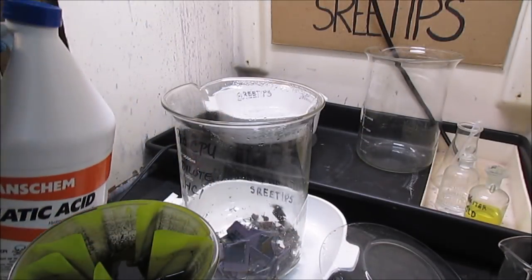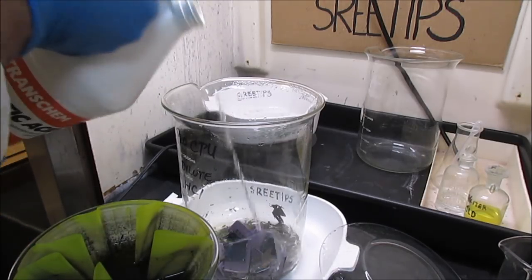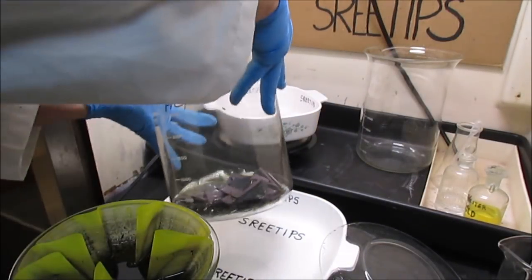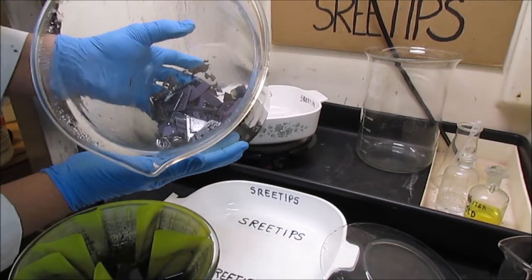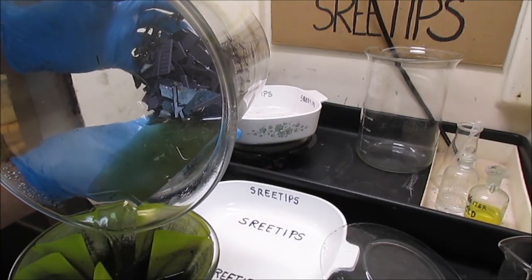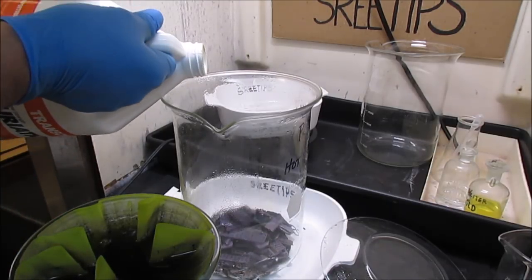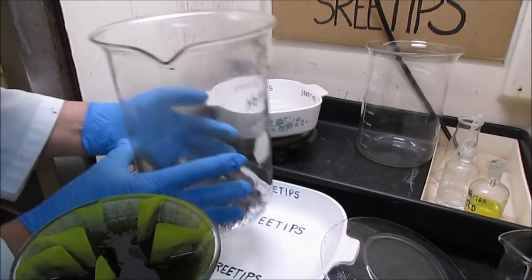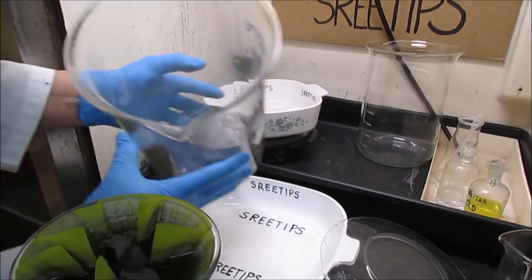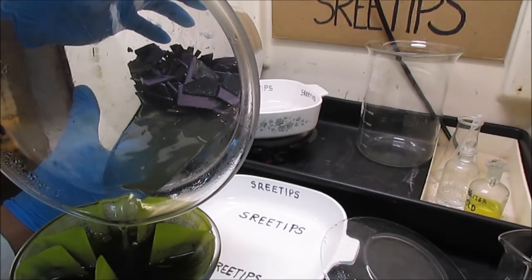First, I'm going to give this a quick rinse with some fresh hydrochloric acid. Just a little bit. Pour that through the filter as well. I'm going to give it a second rinse with some hydrochloric acid here, probably about a couple hundred ml. Pour that right on into the filter.